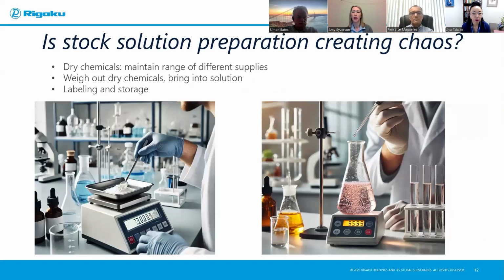Keeping your lab stocked with the right solutions isn't always as simple as putting in an order and having them show up. There's a lot of things that go into stock solution management: maintaining a dry chemical inventory, making sure that you have what you need, that orders are arriving in time. But then comes the real work of measuring out everything, making sure that everything's dissolved and pH'd properly, and then labeling and storing and tracking it all. It's a big process. Staying on top is going to ensure that things continue to run smoothly.